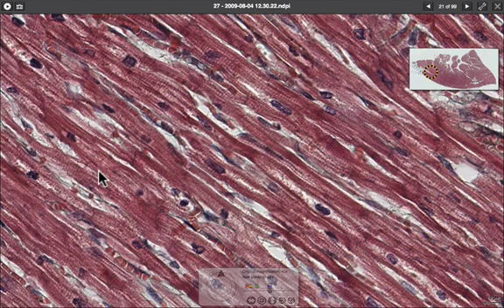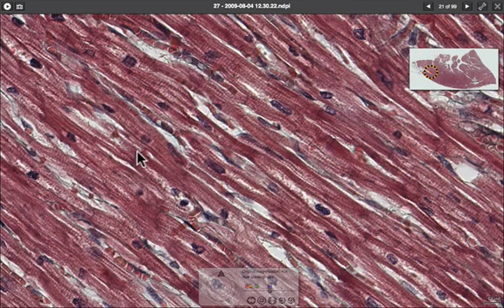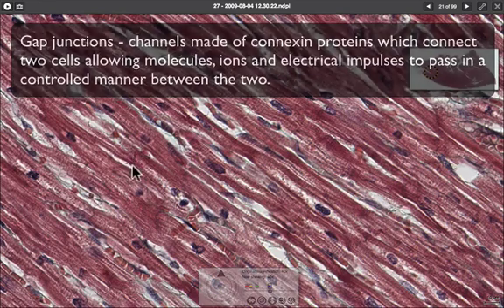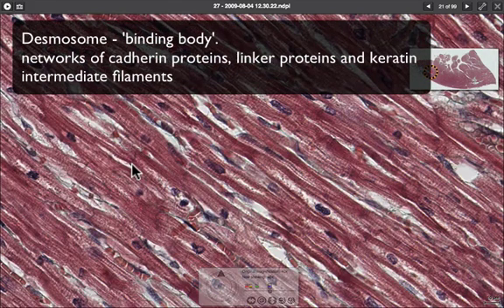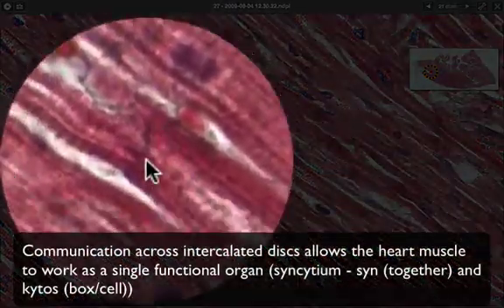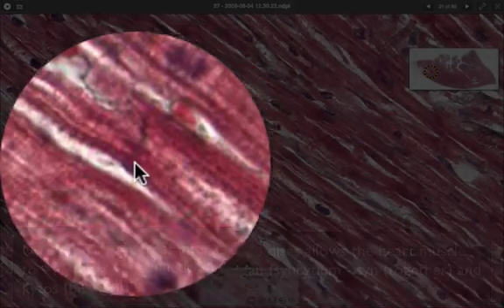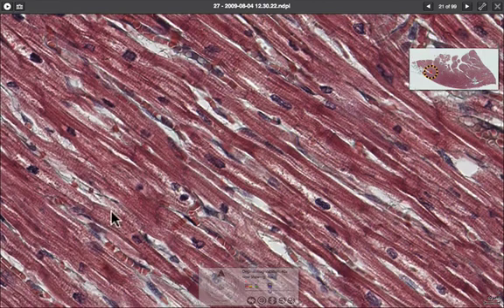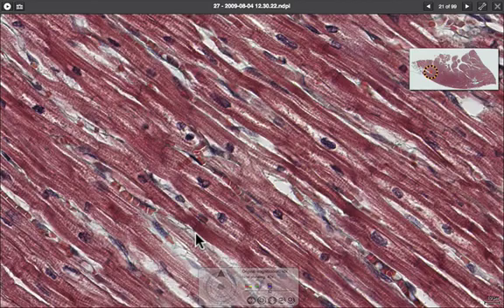There is one other feature of cardiac muscle cells: where one fiber meets the next, they interdigitate with a cluster of gap junctions — to facilitate transport of the signal — and desmosomes to join the cells together. This cluster of gap junctions and desmosome junctions is called an intercalated disc. Each fiber is knitted to the next by intercalated discs, and you can spot several here in this image.